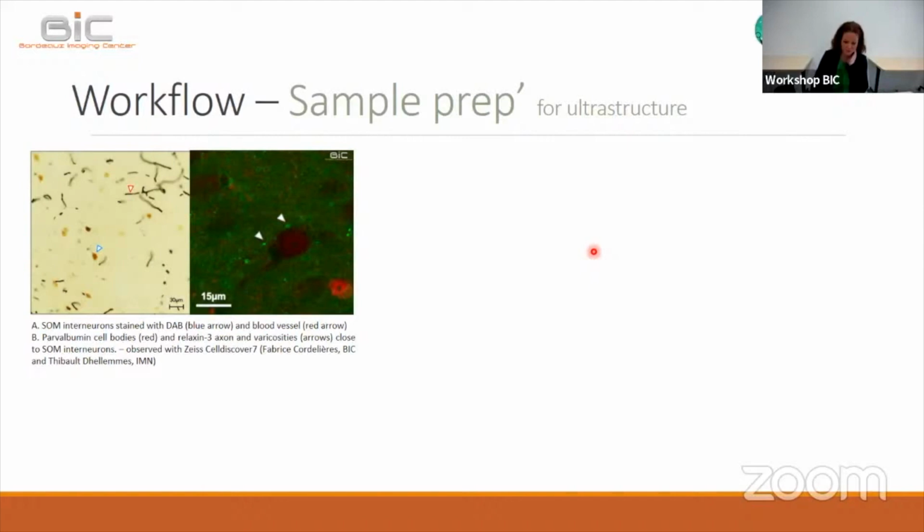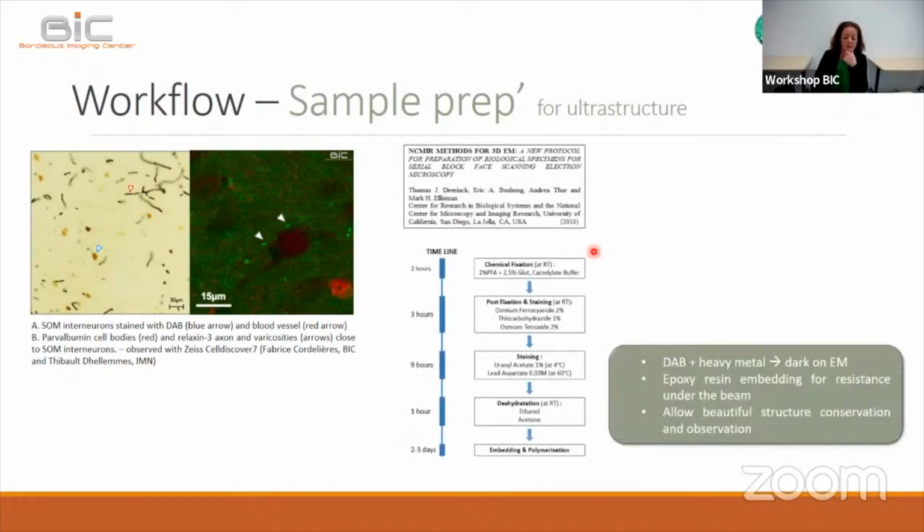parvalbumin cell body. So once you have detected your region of interest, you will do a protocol that is at the beginning dedicated to do serial block face imaging. So Fanny will explain what is serial block face imaging just after.